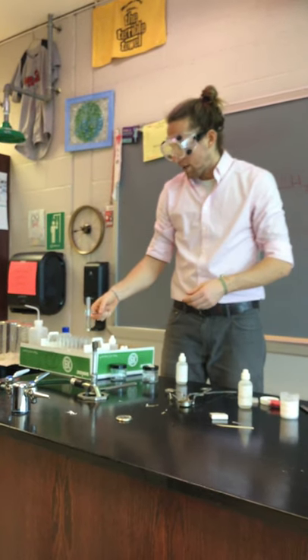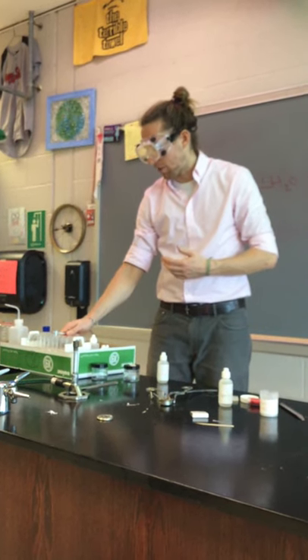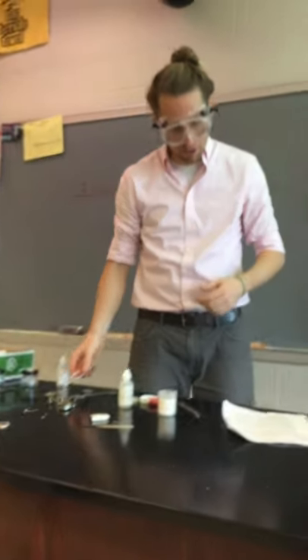And you can see we didn't get that popping sound, but it did put the splint out. So whatever gas we have in the mouth of this test tube was able to put out our flame. So that's kind of an important thing for us to take note of when we're thinking about what sort of gas might have come out of there. And why we have fire extinguishers. Good point, Mrs. Newin.